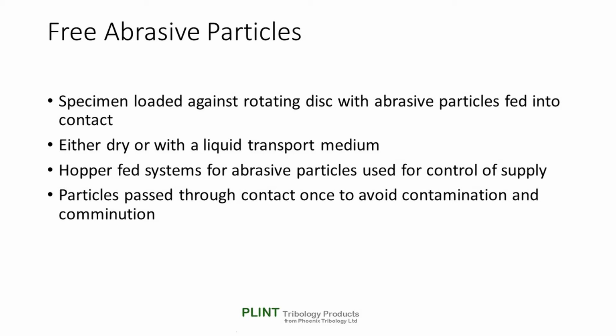In order to avoid contaminating the abrasive particles, whether dry or wet, with wear debris from the test specimens, plus to avoid particle comminution, it is normal to use a single pass system and not recirculate and reuse the abradant.